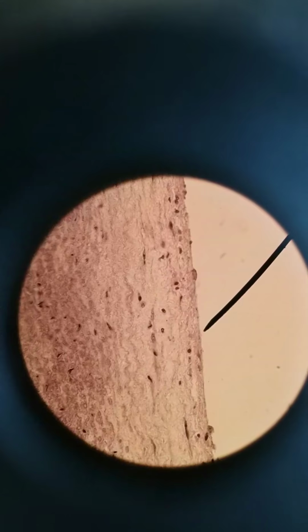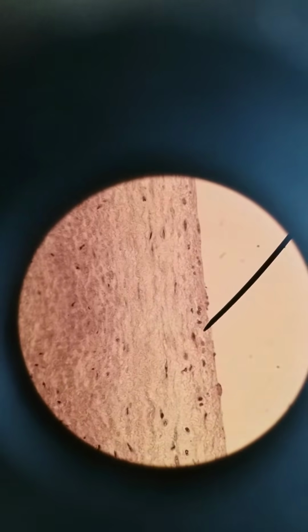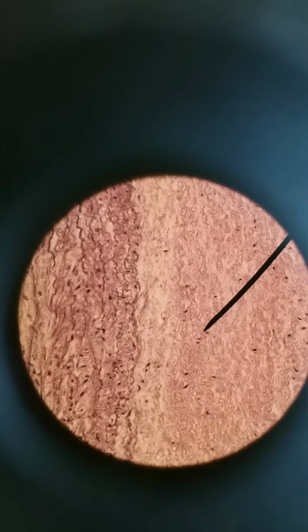vessel. So what we have here in this very first cell layer, that's the endothelium of the tunica intima. Simple squamous, very, very thin, very, very flat. Endothelium of the tunica intima. Below that, you've got a bit of basal lamina and connective tissue.